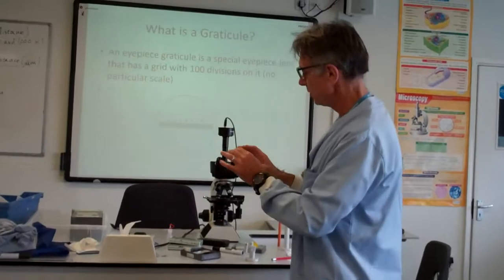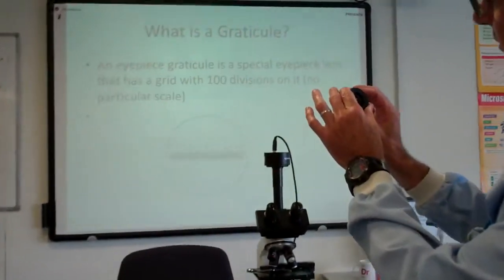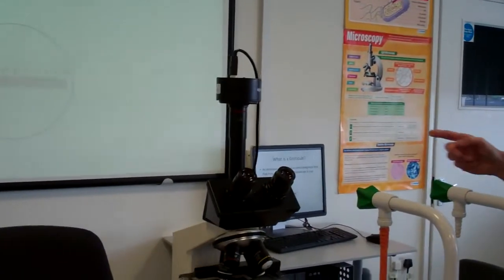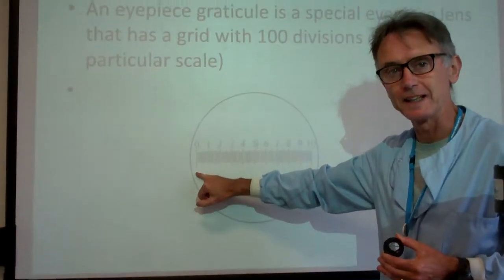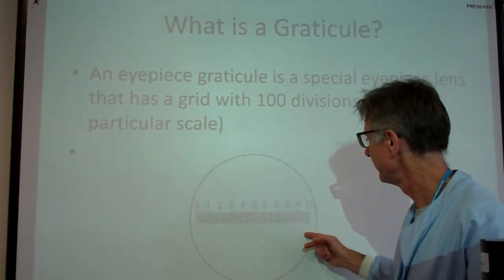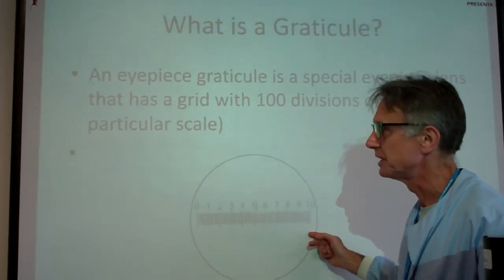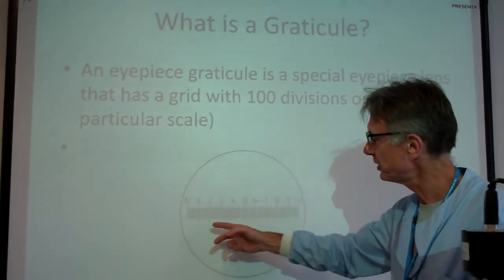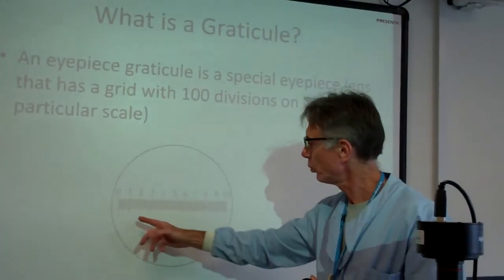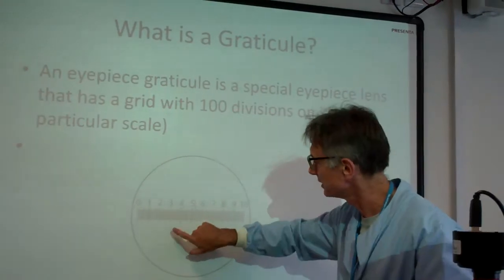If you look down this lens, you'll see that there are ruler marks cut into it. The first stage is to calibrate what distance these marks match at different magnifications. I'm going to show you how to calibrate this to look at how much each of these little divisions represents.